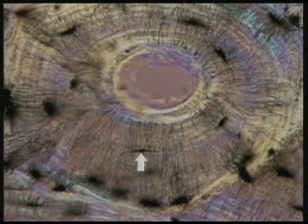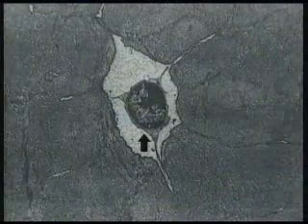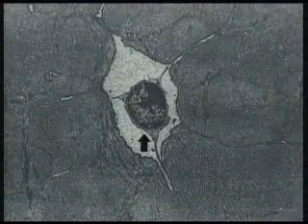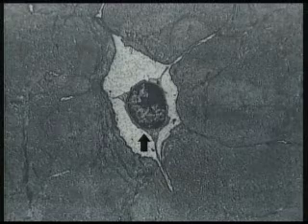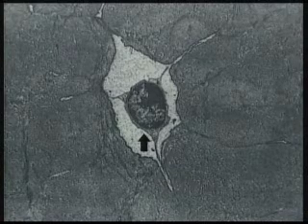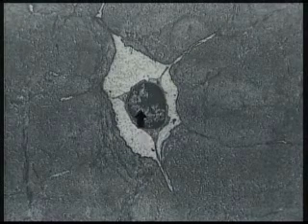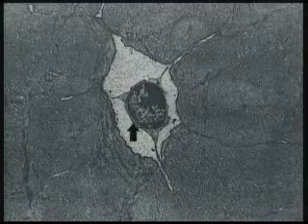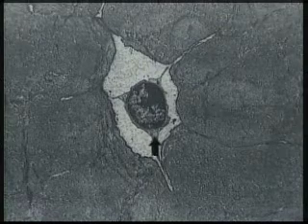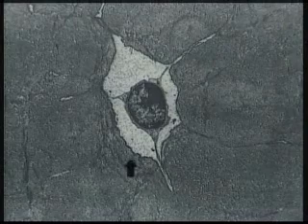Now keep this in mind while we show you an electron image of an osteocyte. Now here is an osteocyte when it's seen with the electron microscope. This comes from plate 1-5 from your visual histology textbook, and you can see right here that this osteocyte is really a tiny cell. Nucleus is here. There's only sort of a remnant of the cytoplasm. There are some osteocyte processes that extend out through tunnels in the bone here, and this is all solid bone.